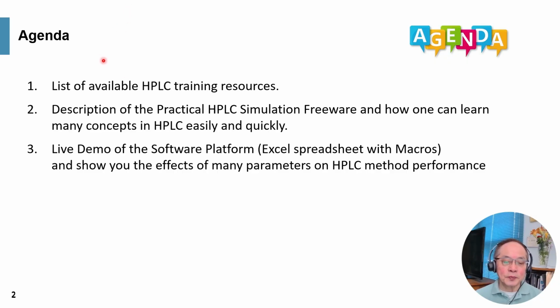Here's my agenda. We start off with a list of available HPLC training resources as of today. Second, we're going to describe this practical HPLC simulation freeware, which is a program in Excel, and how one can learn the various concepts of HPLC easily and also very quickly. Finally, I will perform a live demo to demonstrate the software platform, which is an Excel spreadsheet with macros, and show you the complex effect of many parameters on HPLC method performance.